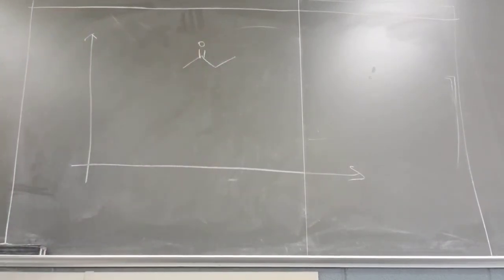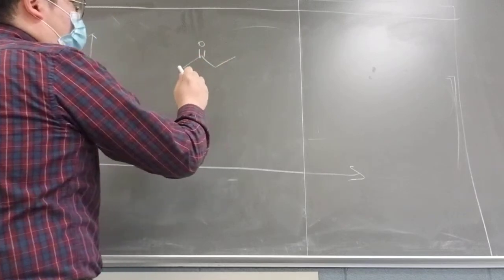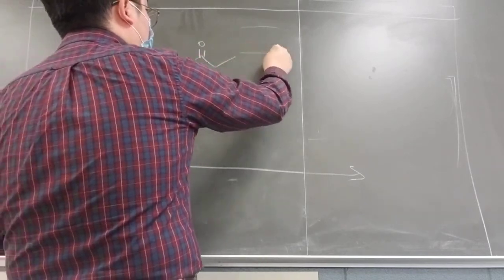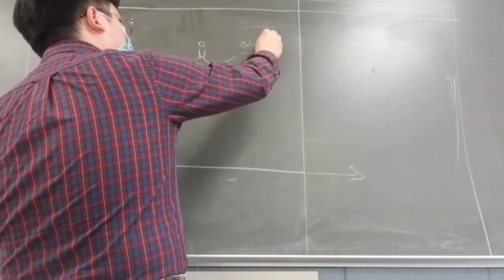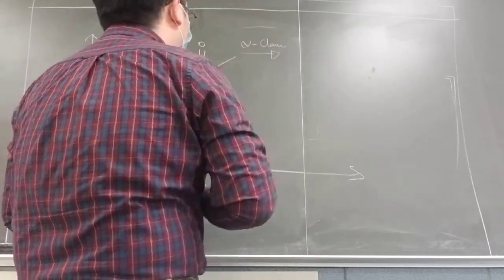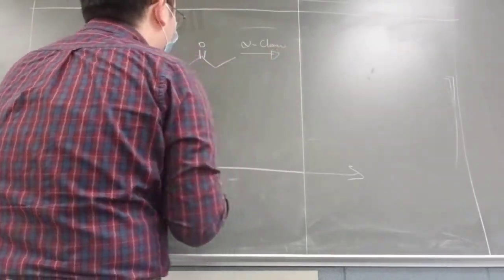So if you have some carbonyl compound, what you can also predict from here is you can think about the alpha cleavage. They might be too small for McLafferty rearrangement, so you can think about the alpha cleavage over here.